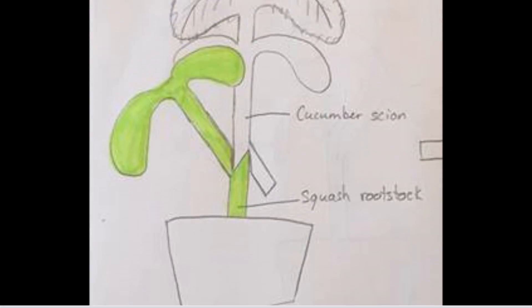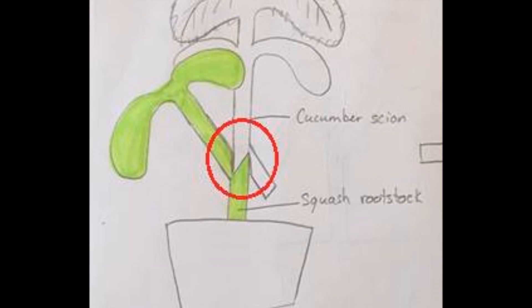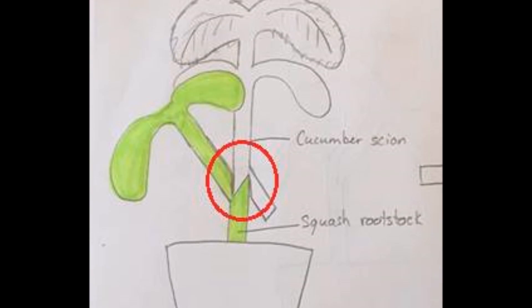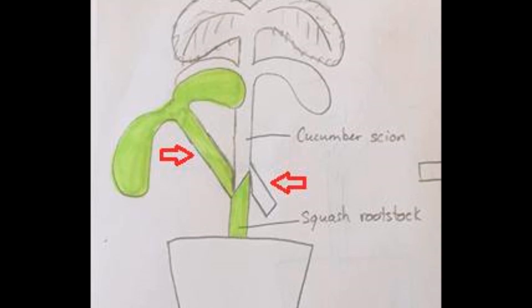The graft will be done using the tongue approach technique, which basically consists in cutting both scion and rootstock at the same slanting angle to favor cambial contact and increase the healing process. However, note that both stems are not cut entirely and a stem part remains on each to support the graft.